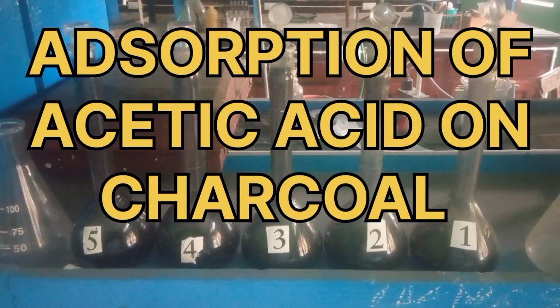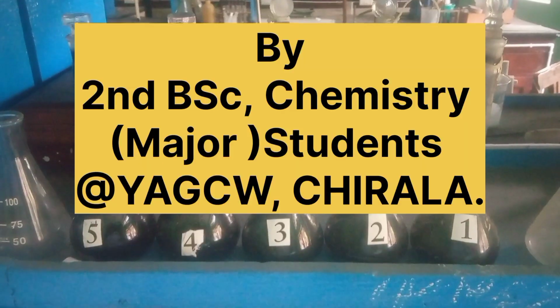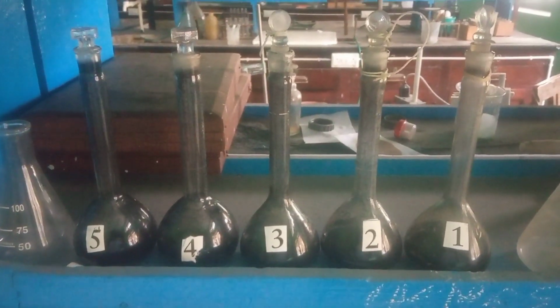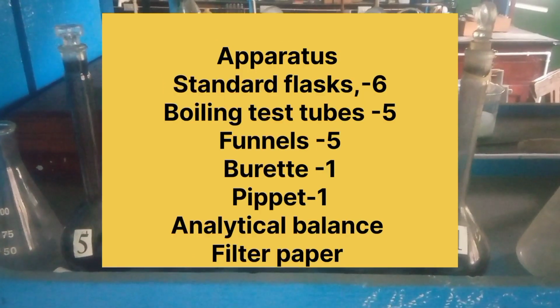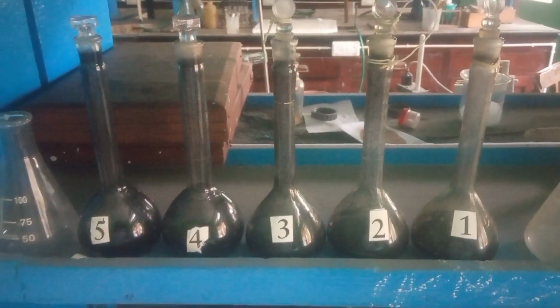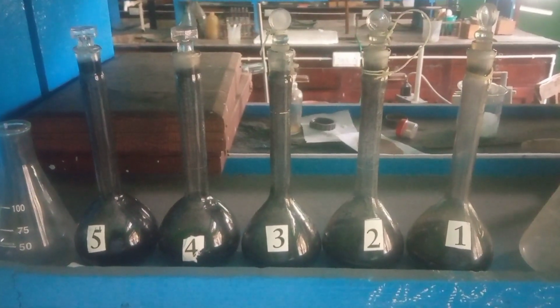Adsorption of acetic acid on charcoal. This experiment helps us to verify the relation between intensity of adsorption as well as mass of adsorbent.